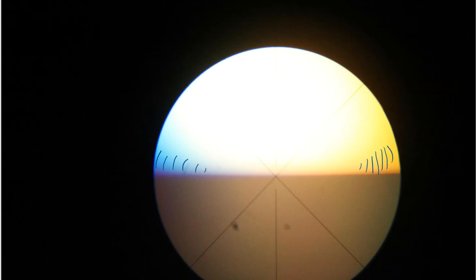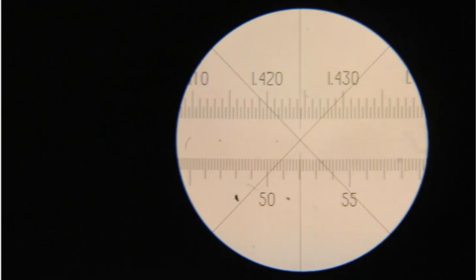So I'll go back to the flipper switch to the left-hand side, and I'll hold the flip switch down. And when I hold the flip switch down, this is what I see in the view. This is how you use a refractive index, folks. That's all there is to it. So I'm going to let you write down the number that you think this value readout is supposed to be.